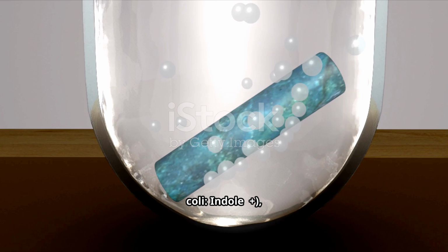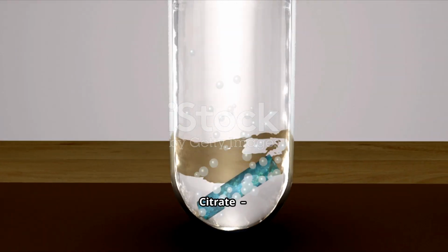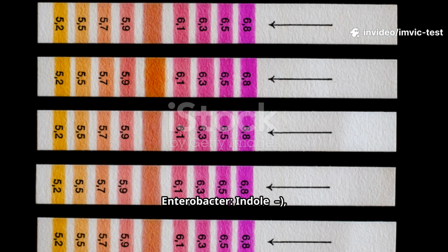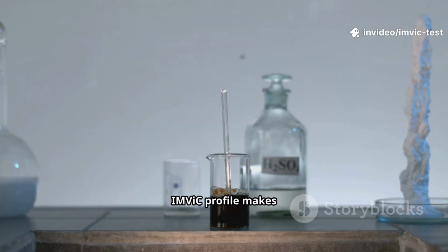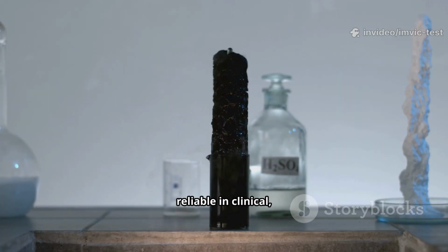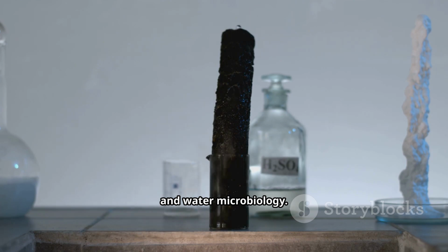When we combine these 4 tests, a pattern emerges. E. coli: indole positive, methyl red positive, VP negative, citrate negative. Enterobacter: indole negative, methyl red negative, VP positive, citrate positive. This IMViC profile makes identification faster and more reliable in clinical, food and water microbiology.